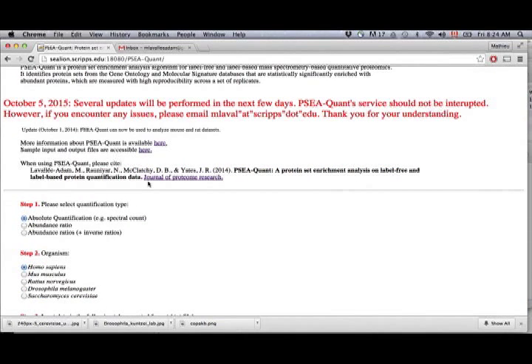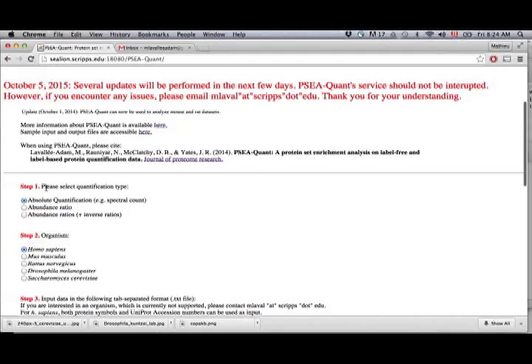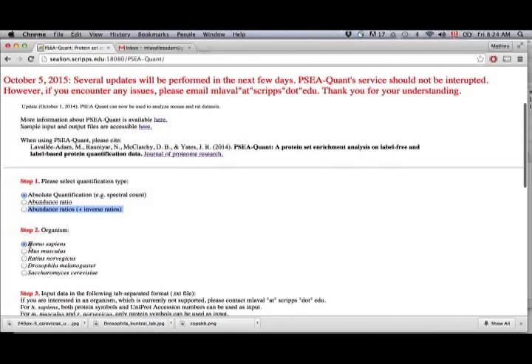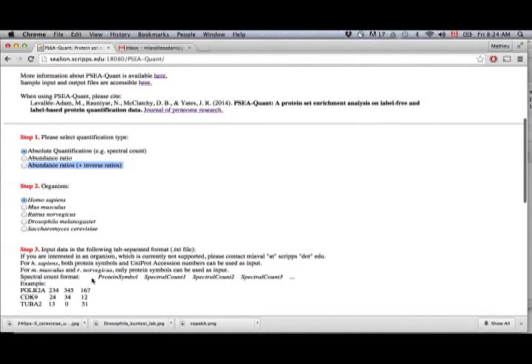Some of the new things since last time: we have an option to select the quantification type of the mass spectrometry-based proteomics analysis, and the abundance ratio with the addition of the inverse ratio is now an option for the user. The organisms now include mouse, rat, human, Drosophila melanogaster, and yeast that can be used for the analysis.